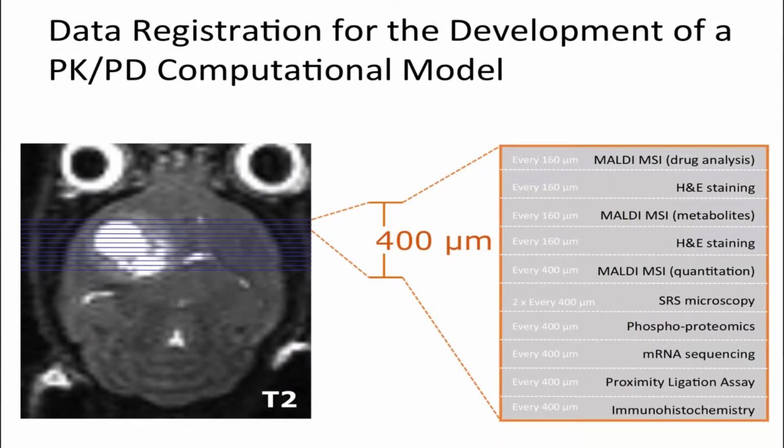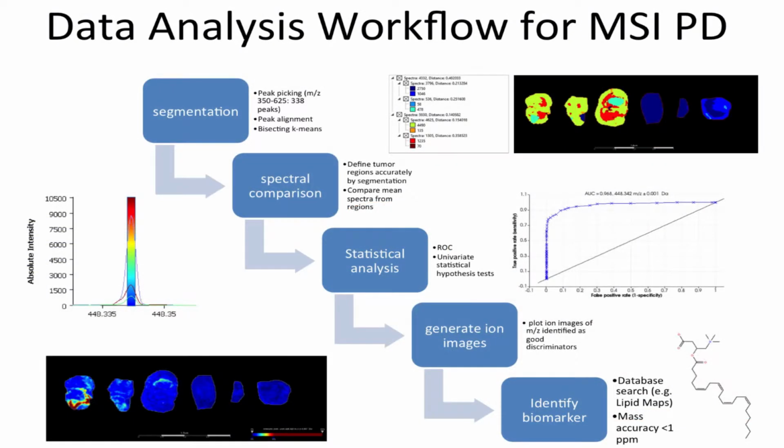And now, basically, the big task is to be able to bring all of this together. And one of the limitations in bringing the imaging data together is that every time we take a different tissue section and subject it to a different treatment, we introduce tissue distortion into the tissue, making it very challenging to delineate tumor and incorporate response into this.